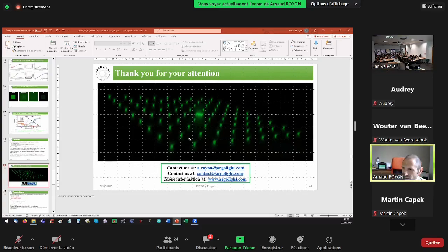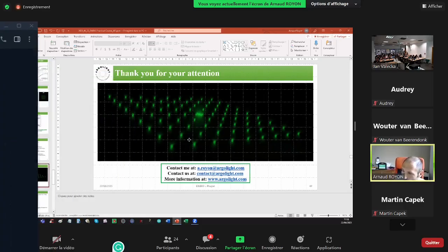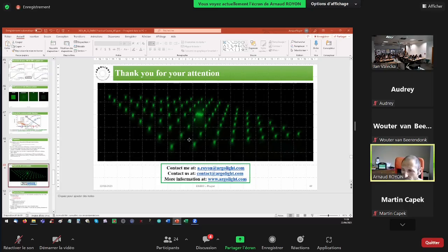Yes, we heard about this. The values that have been reported were reported because the authors, or the people who use our slides, relied on the specified distances, which have some manufacturing tolerances, and they didn't use our software, which actually measures the distance between the lines. So there may be some uncertainty in the measurements they did, uncertainties that are taken into account when you use our software, because we actually measure the line spacing.